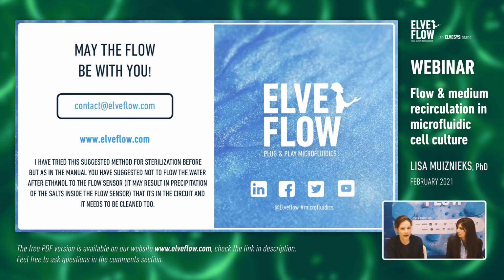Then we strongly recommend, after you've cleaned it, to use either Helmanex if you want to do a deep clean, or the cleaning solution followed by water, followed by ethanol, followed by air drying if you're going to put it away. But if you are going to keep it in line in your system, water is fine.